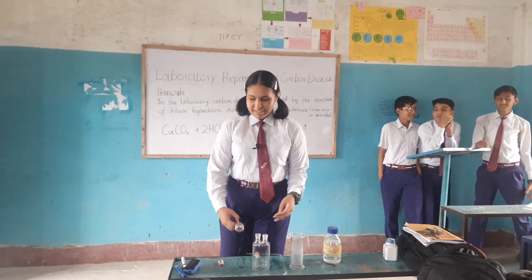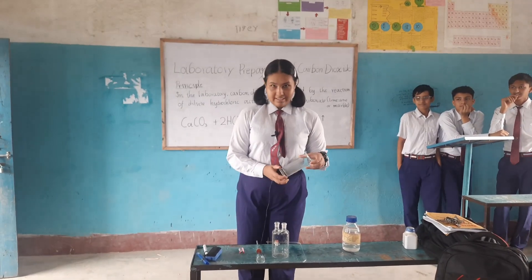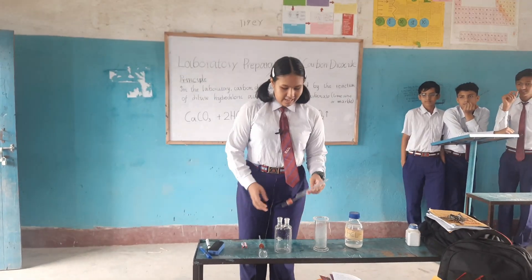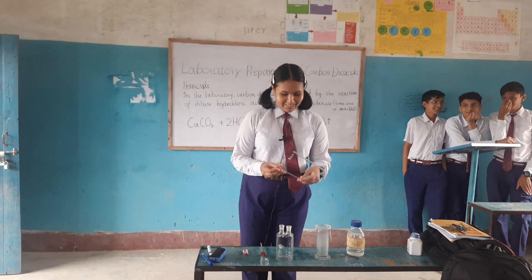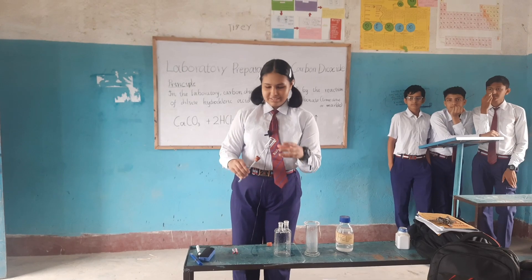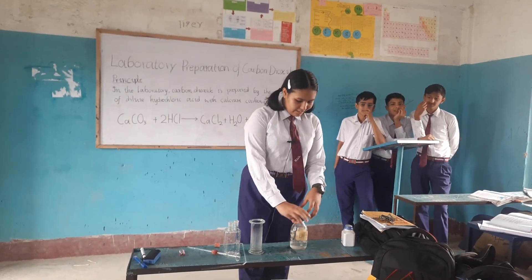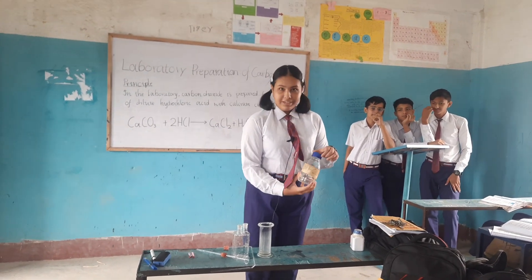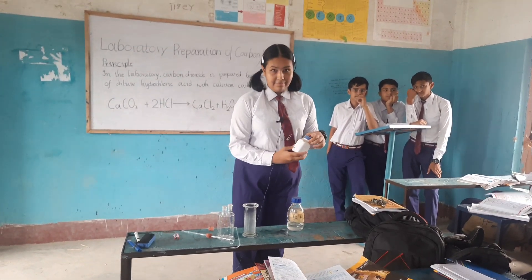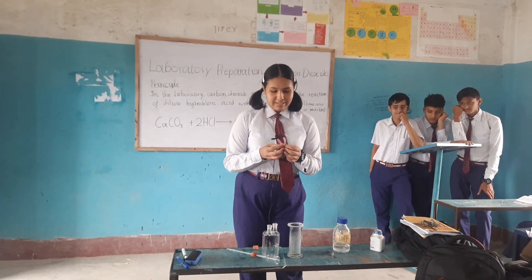For the chemical reaction, apparatus is a must. Here we have a gas jar to collect the carbon dioxide gas. This is the delivery tube and this is called the Wolf bottle. Here we have dilute hydrochloric acid as our first chemical and marble chips as our second chemical. We also have litmus paper for testing whether the gas produced is carbon dioxide or not.